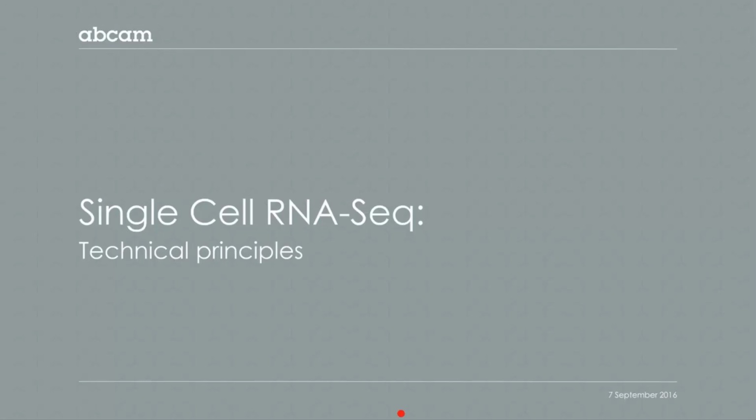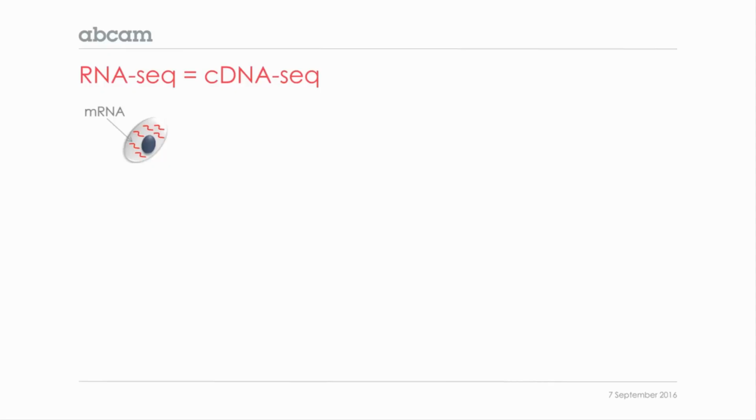Now I will move directly and briefly explain a little bit of the molecular biology behind the single-cell protocols. So basically, when we say RNA-Seq, we always actually do cDNA-Seq. And when we talk about the normal protocol, we start with cells. We break them. We get the RNA. This is called the lysis step. Then we use reverse transcription that basically copies the RNA into a DNA strand. This is called the first strand synthesis.